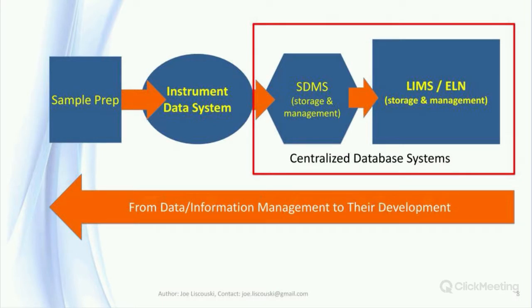Things that get stored on computers tend to live there forever. Anyone who has a little pack-rat in them understands the problem, and deleting files can compromise compliance with regulatory requirements. You need to organize the material in a way that it can be searched, found, and used. Given the amount of data and information a lab can produce, that can become a problem very quickly. You have to start planning on how to manage the data and information as soon as you can to prevent it from becoming a major headache.